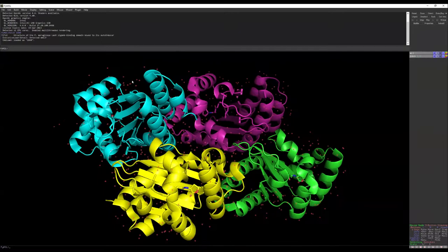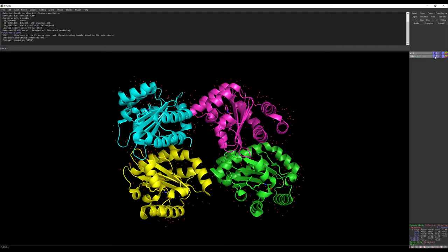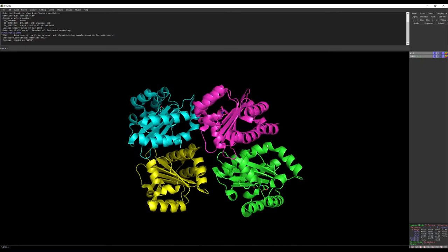Let's first refine the structure. You can see these red plus signs — they are water molecules. Let's remove the water molecules first by going to A, then remove waters. Now we have removed the water molecules.